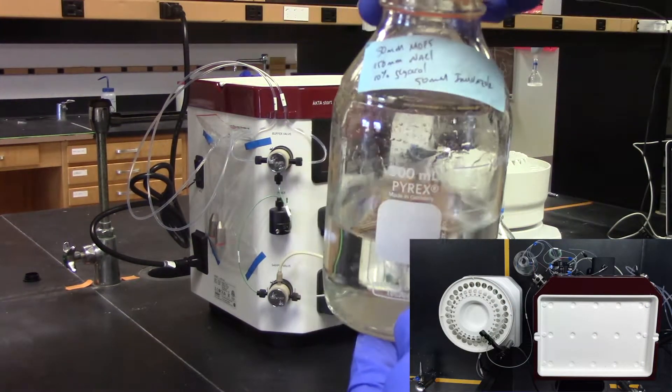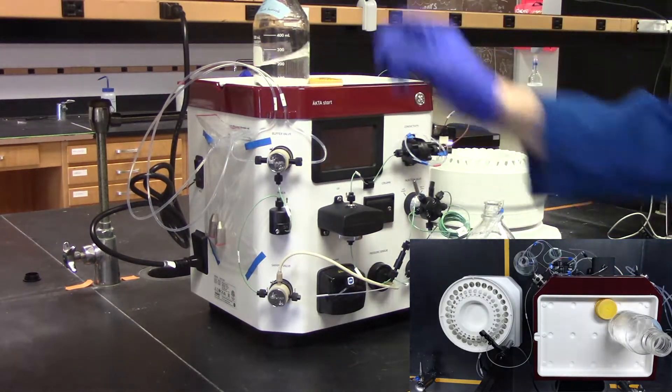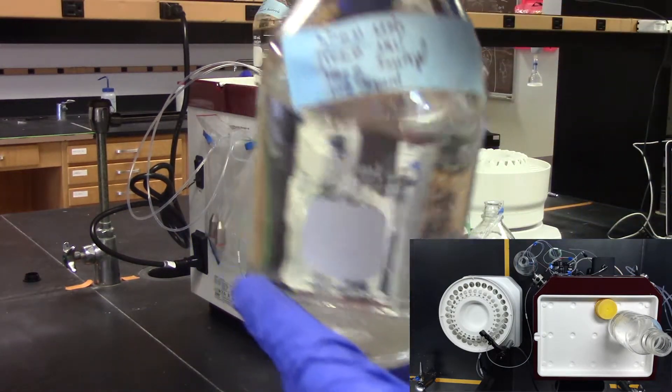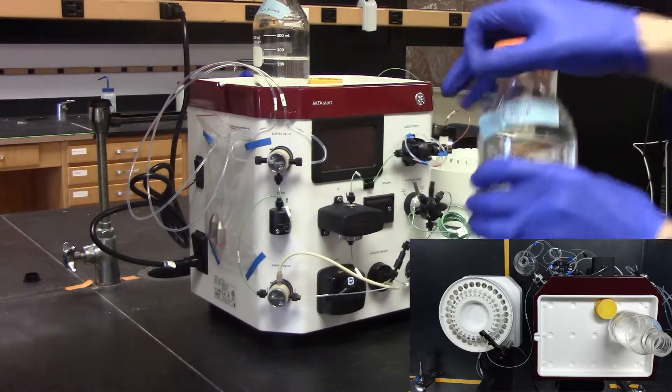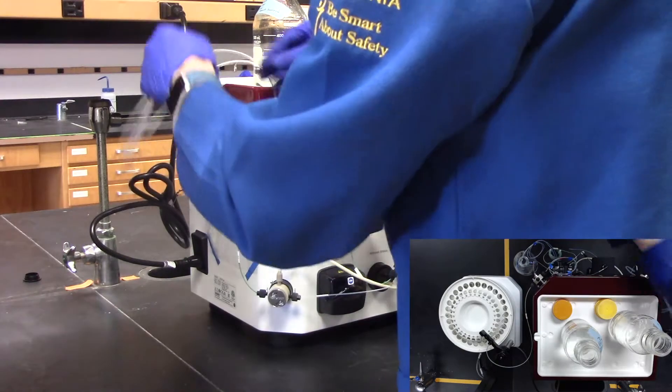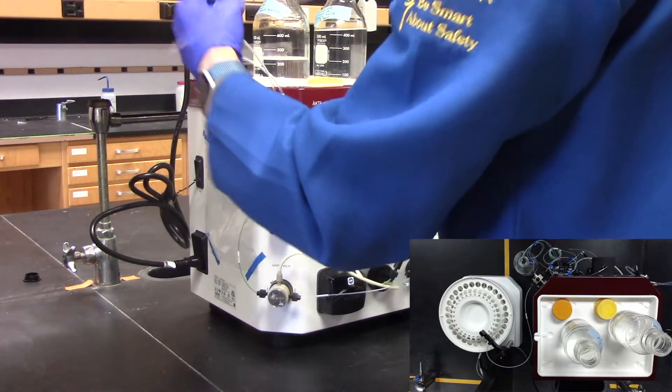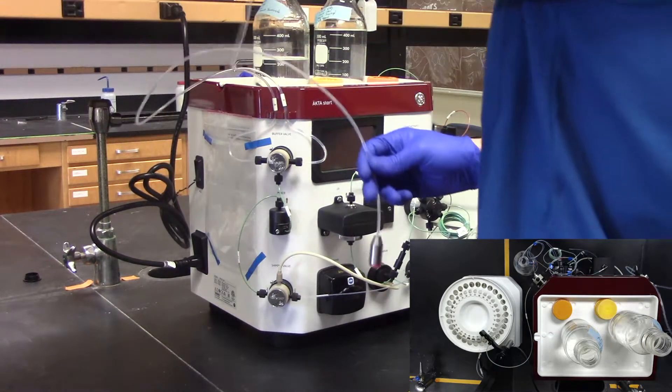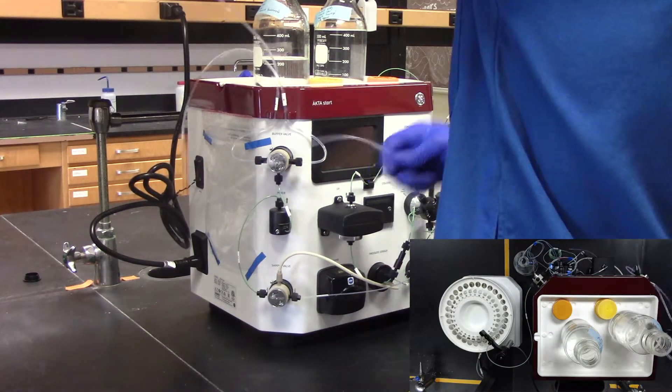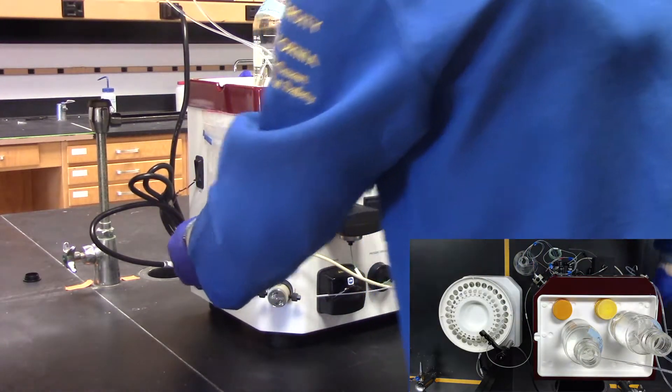We now need to prepare the FPLC. To begin with, place your lysis buffer and your elution buffer on top of the FPLC. Insert your A line into the lysis buffer and B line into the elution buffer. Turn on the FPLC.